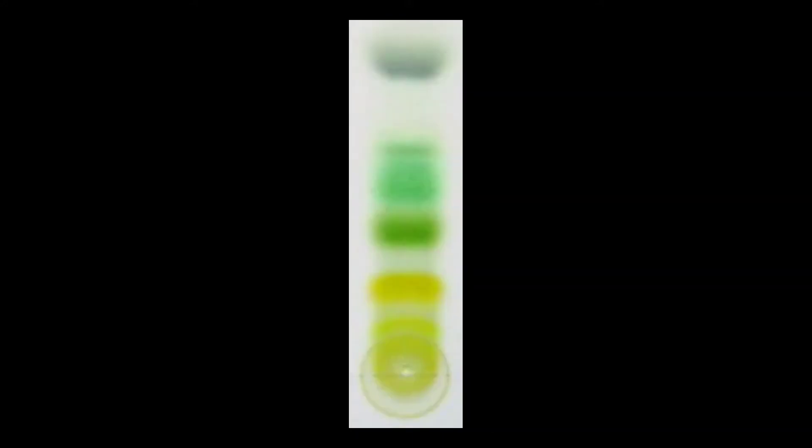In thin layer chromatography, a plate covered with a thin layer of silica is placed into a beaker with a small amount of solvent, which is absorbed up the silica. As the solvent passes over the mixture, the mixture is separated based on how polar each part of that mixture is.